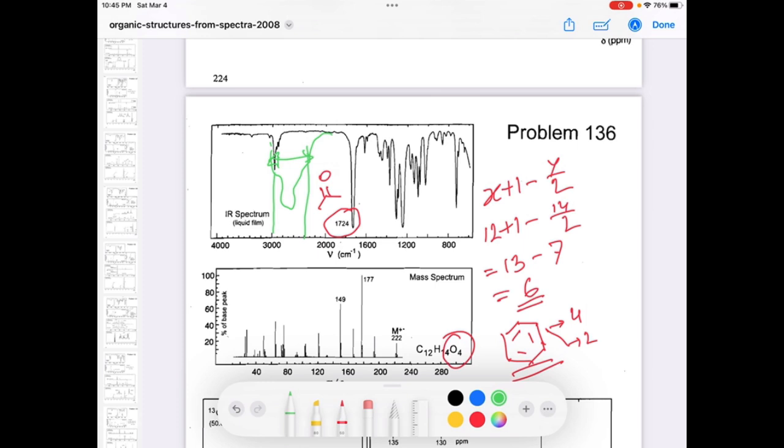So in that case, you can think that you don't have the carboxylic acid, because the IR is not showing that peak. But definitely you have the carbonyl group and you have 2 oxygens, so you might have an ester group. So in that case, let's see how we can determine that ester group. You have the carbonyl group and definitely another oxygen, so it should be an ester group, and it could also be proved by the proton NMR.